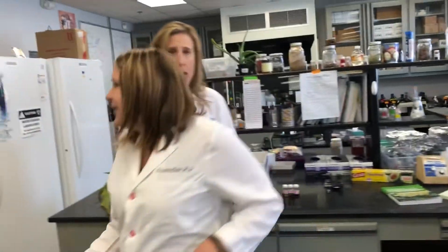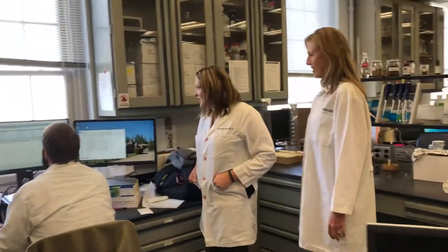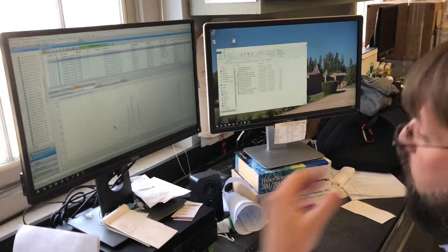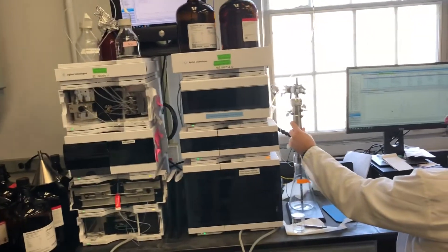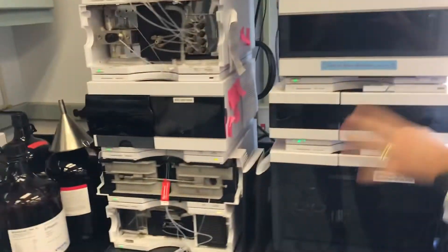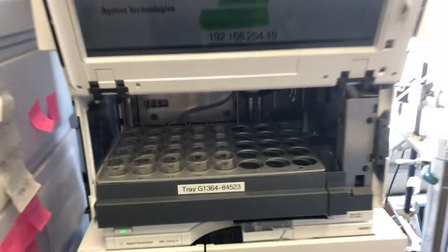This is where Dr. Wiles comes into play. This is our preparative HPLC system — a pump and a larger column that we use to separate out compounds from mixtures in slightly larger quantities, not as large as the flash but much larger than an analytical system. It also has a fraction collector, so we can inject a mixture onto the system, and then each of these tubes will hopefully be collecting an individual compound. We can monitor that process using the software.